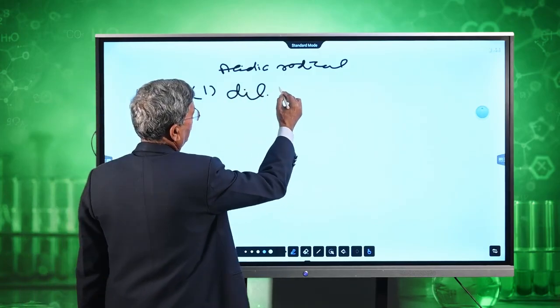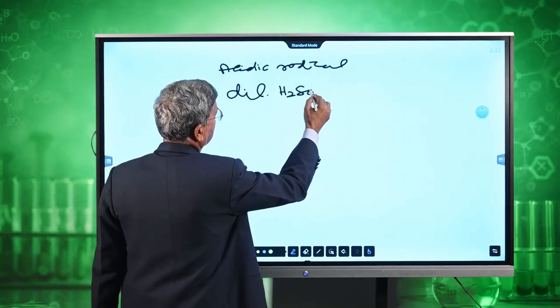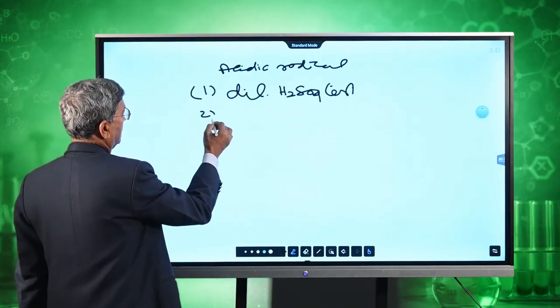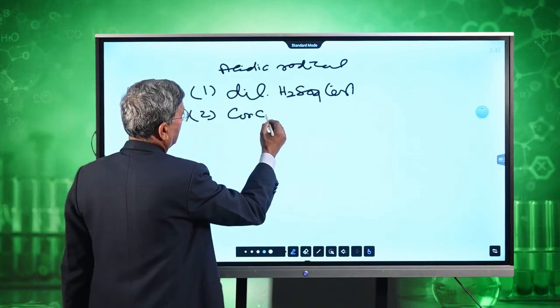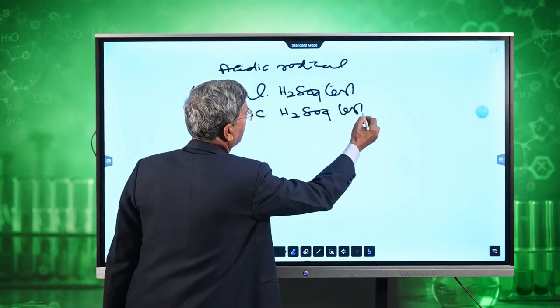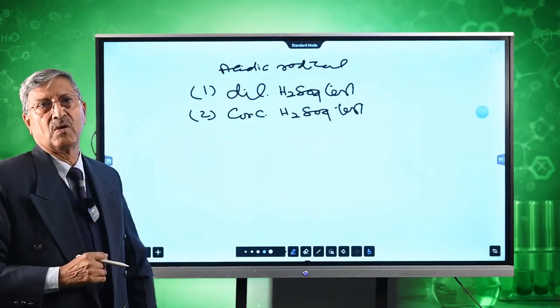These tests are, number one, the dilute H2SO4 test, and number two, the concentrated H2SO4 test. What are these tests?